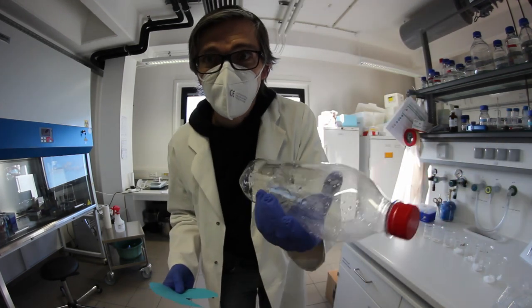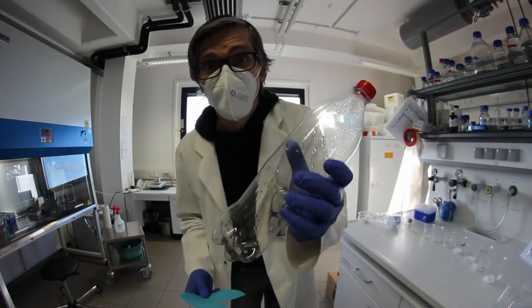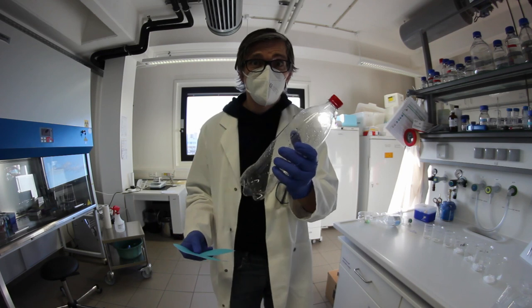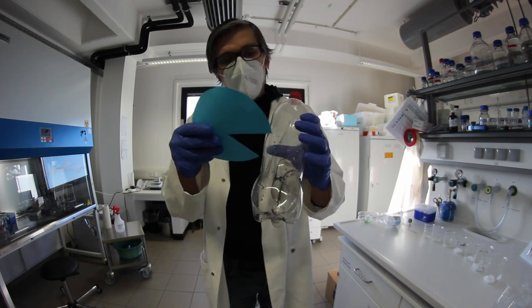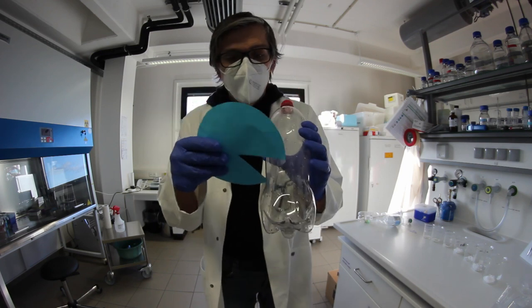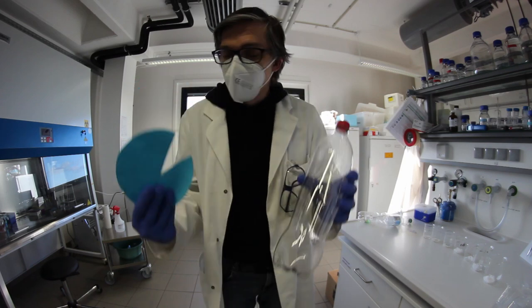On the other hand we have these kind of bottles. This is a PET which was stretched during the production process and that makes it unhydrolyzable for the enzyme. So there is no chance. Sorry for that.